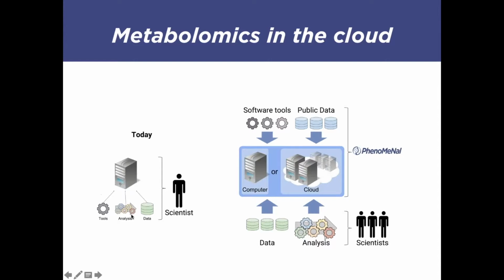And because setting up all of these bioinformatics and metabolomics tools is difficult, taking this to another set of machines that is larger, where you could run your analysis faster, is very difficult. You would need a lot of manpower to be able to do the same setup, to be able to take that compute ability to some other place.